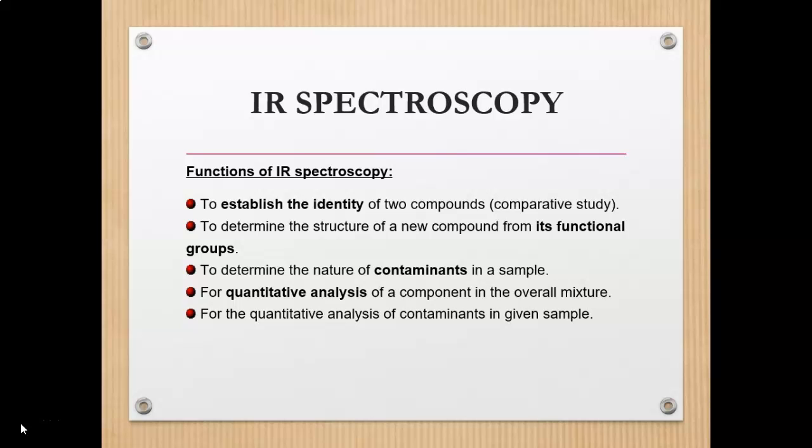And we also use FTIR for quantitative analysis of a component in the overall mixture, and for the quantitative analysis of contaminants in a given sample by observing the area below the graph. All right.